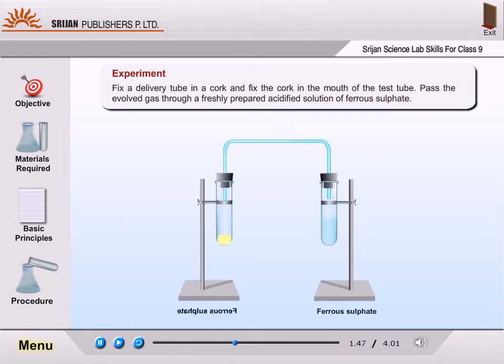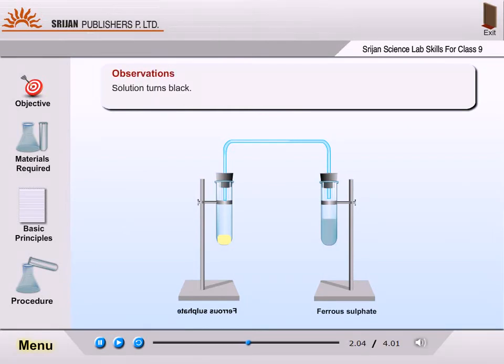Fix a delivery tube in a cork and fix the cork in the mouth of the test tube. Pass the evolved gas through a freshly prepared acidified solution of ferrous sulfate. Solution turns black.